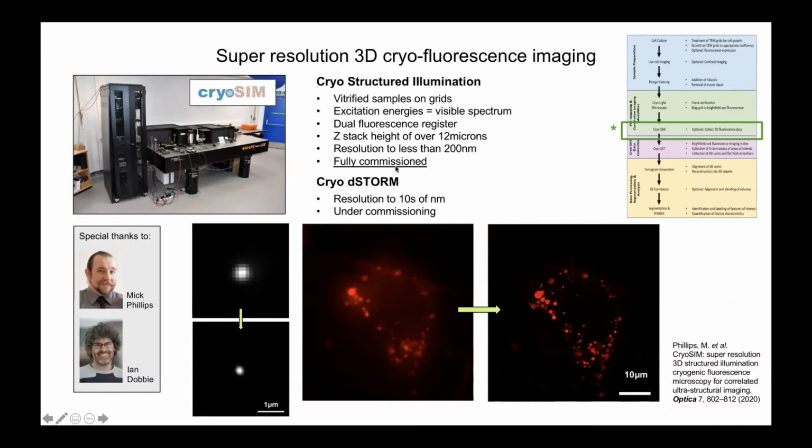The cryo-d-STORM facility is under commissioning, I'm afraid, because we're still having issues with fluorophores. They are just beasts at liquid nitrogen temperatures, and they just won't blink that easily.